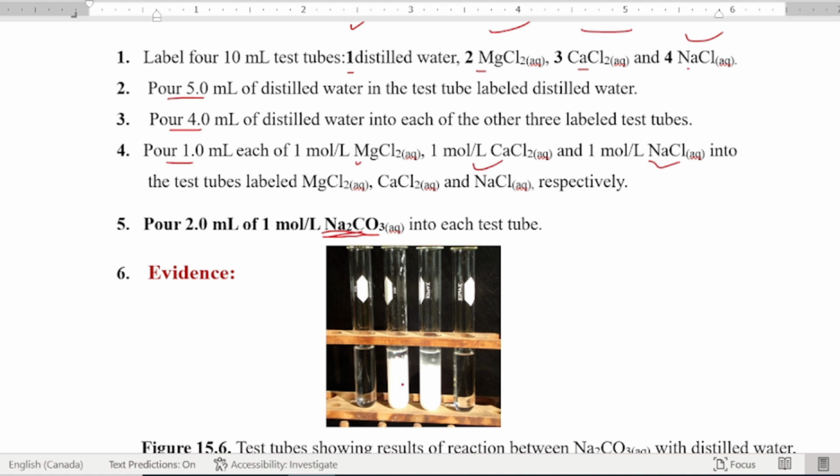Do you think there will be any calcium and magnesium ions remaining there if you pour enough sodium carbonate? If you said no, then you could be right. Okay, this is the excess reagent, then only calcium and magnesium ions would be expected to be precipitated out of solution. This is what we will do now.